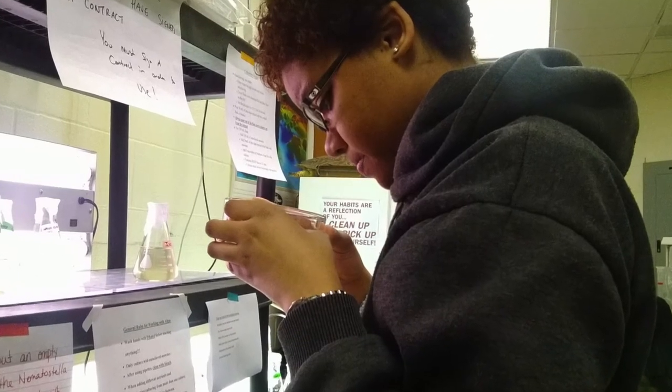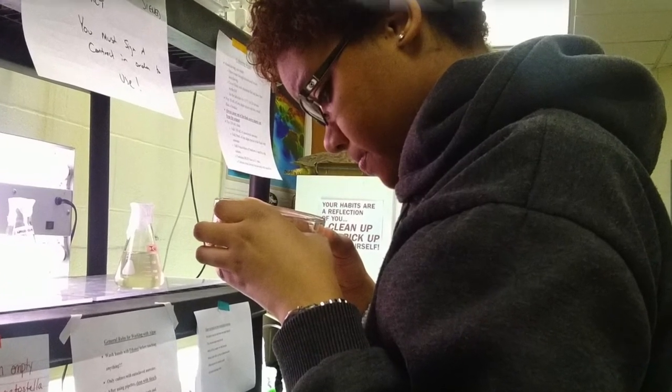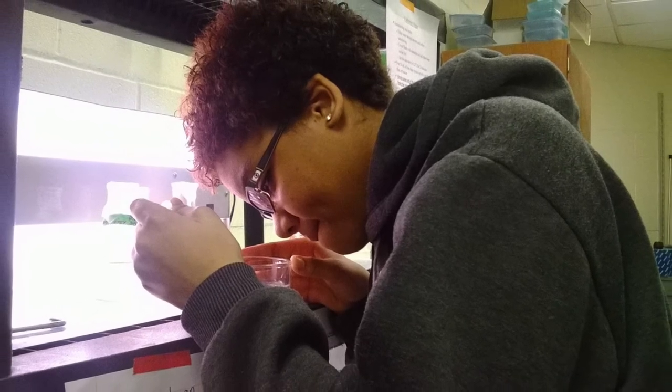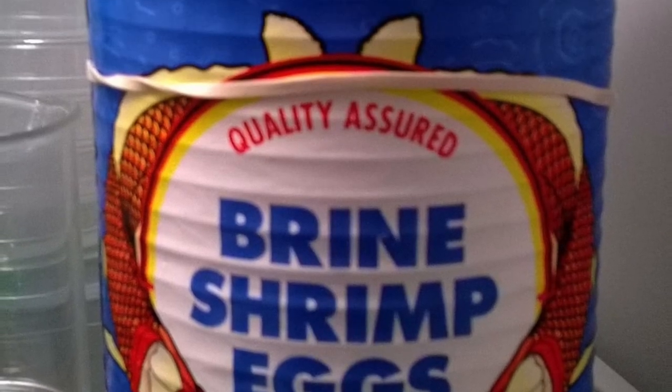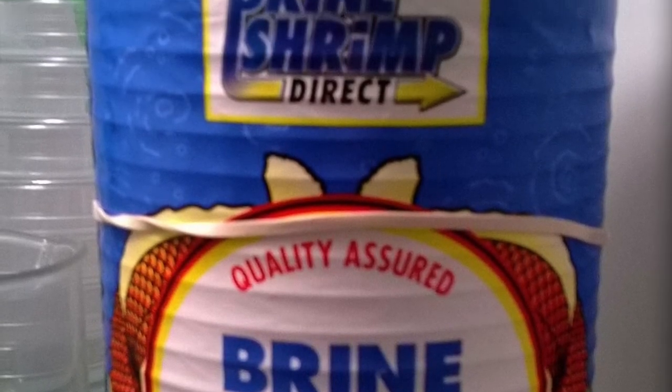Every morning I check the nematostella and stare deep into their souls, and also take out any eggs if they were spawned overnight.